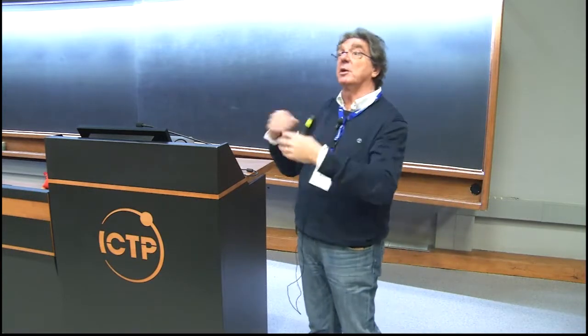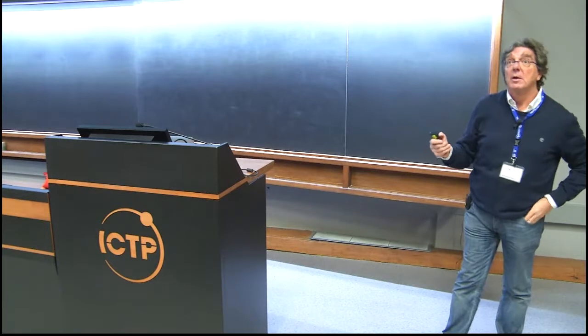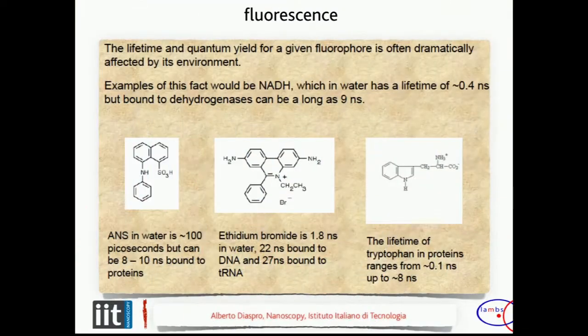We will see also tomorrow that we have solutions for removing this kind of problem. However, this is very important. And you can have measurements of lifetime in different ranges, as you can see here. Today, we are really able to measure changes in the range of nanoseconds. You can perform this experiment in solution, so the environment is all the same, and you have an overall average condition in order to check the lifetime of your molecule under conditions that you are able to control.